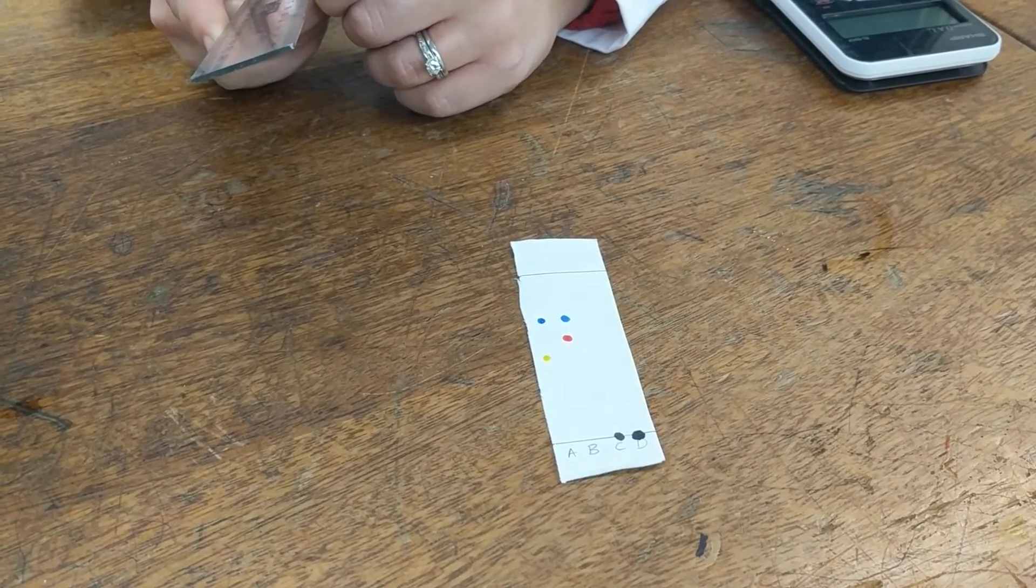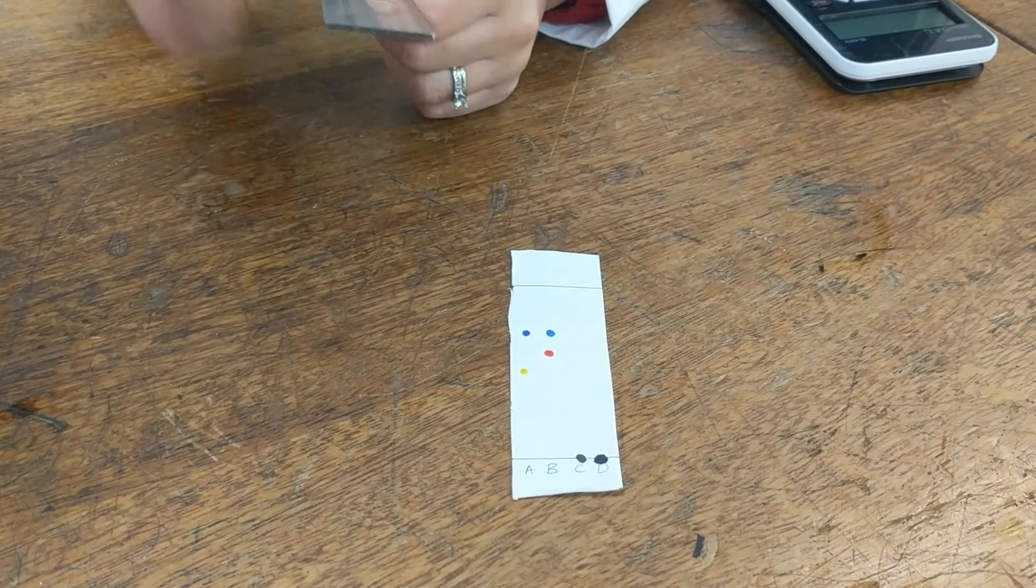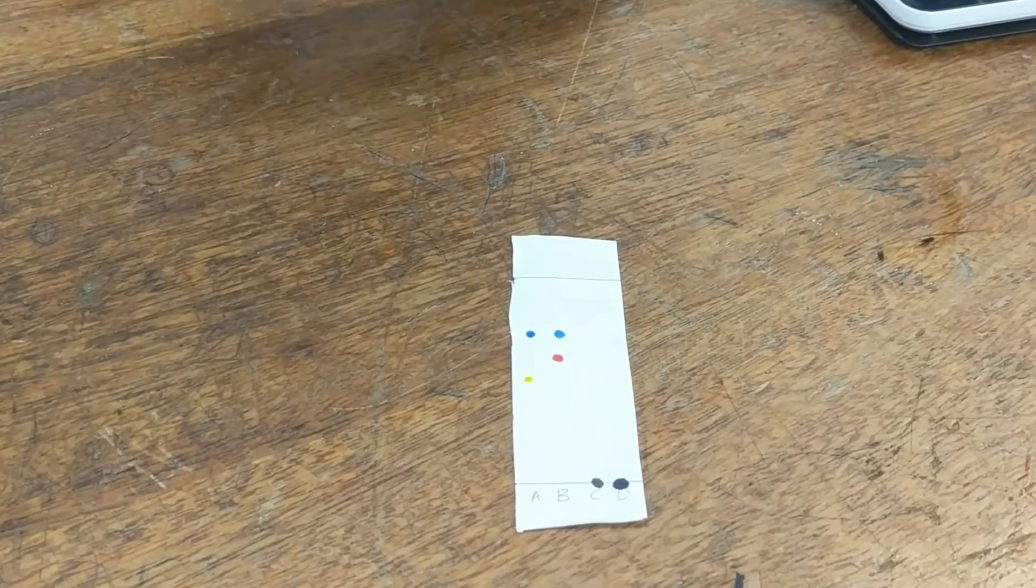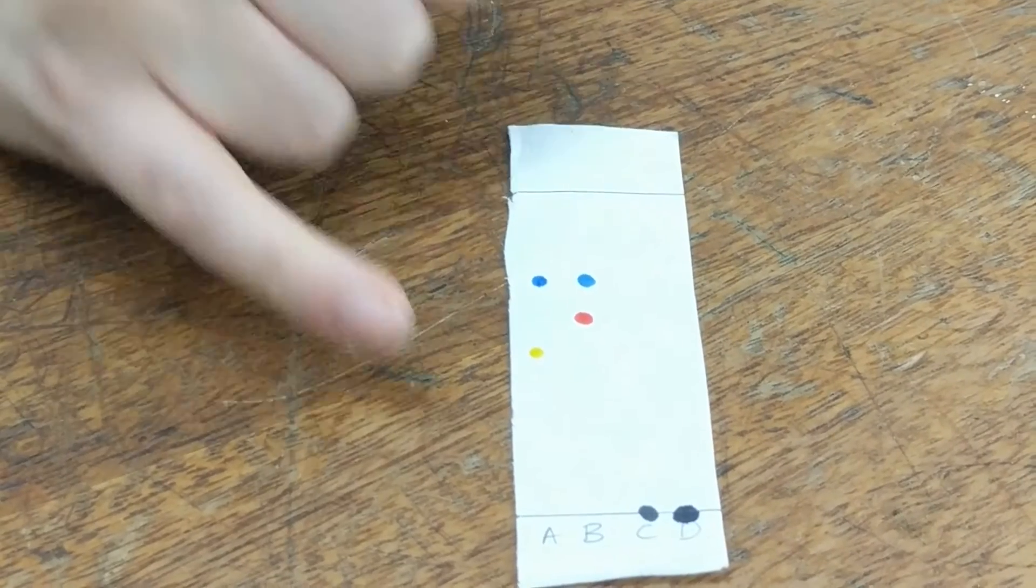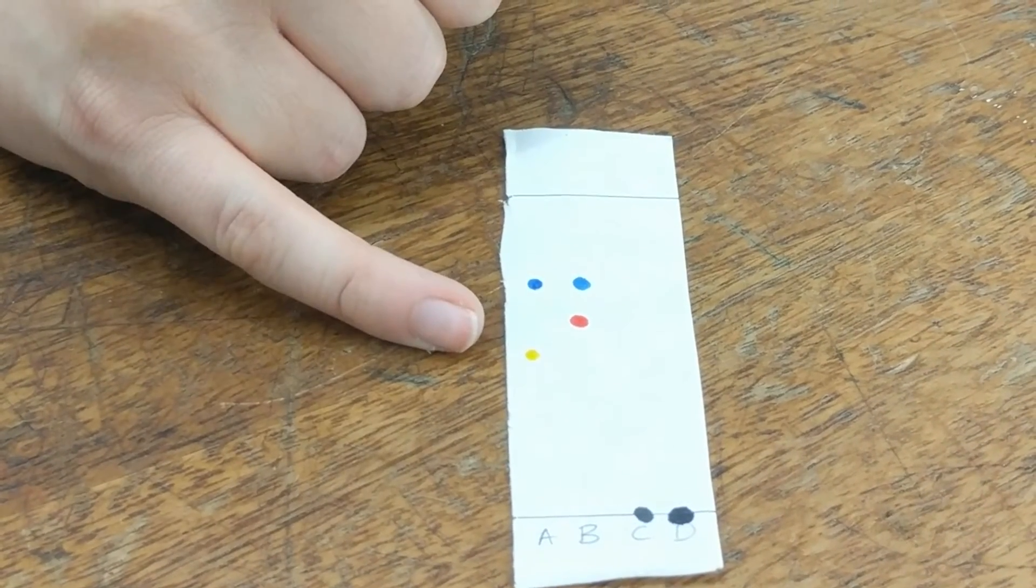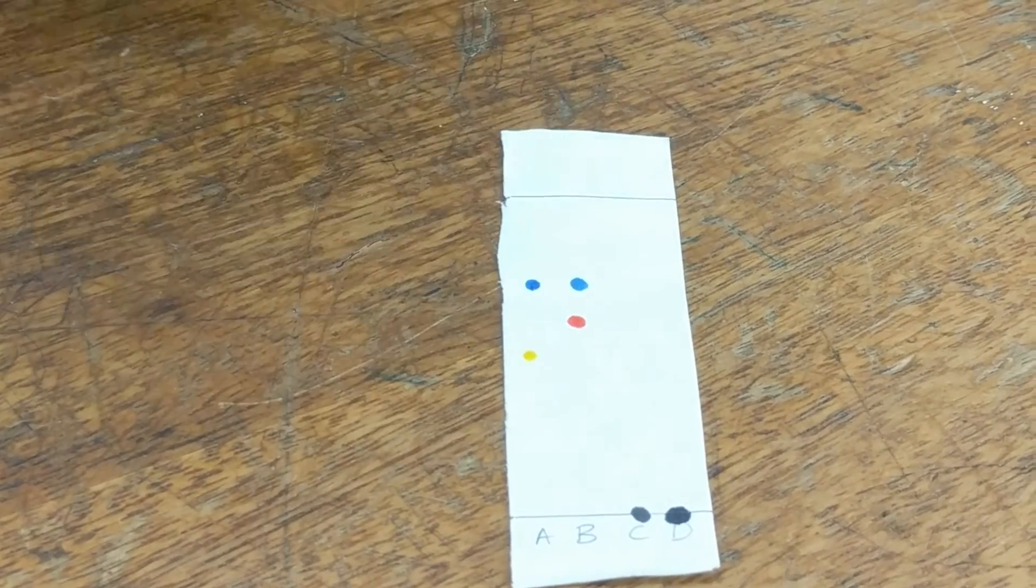However, A and B were water-soluble. And you can see, just from looking at it, what the common components are. So in A and B, they both contain the blue component. In A, it's got yellow. And in B, it's got red, which is different between them.